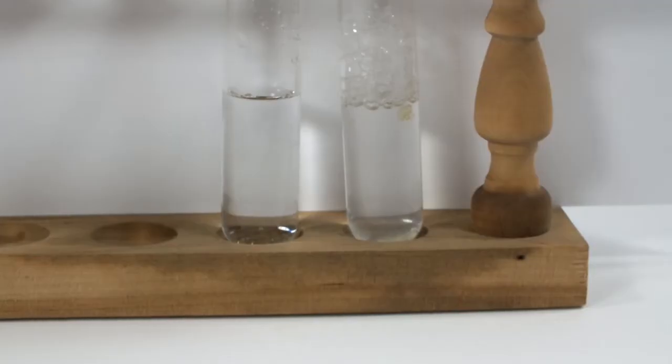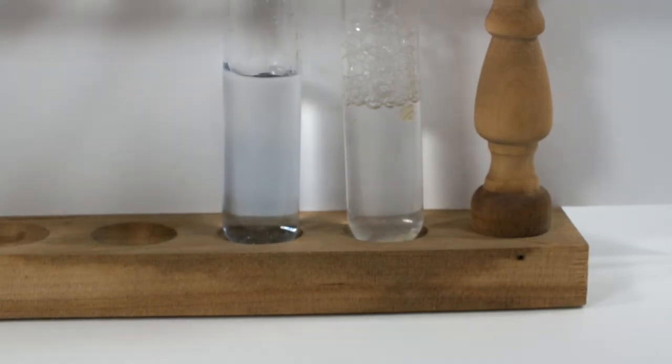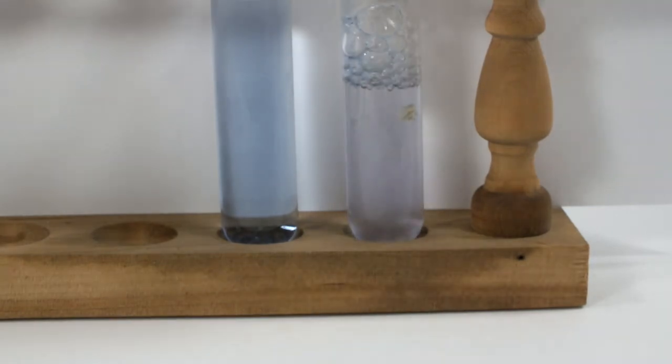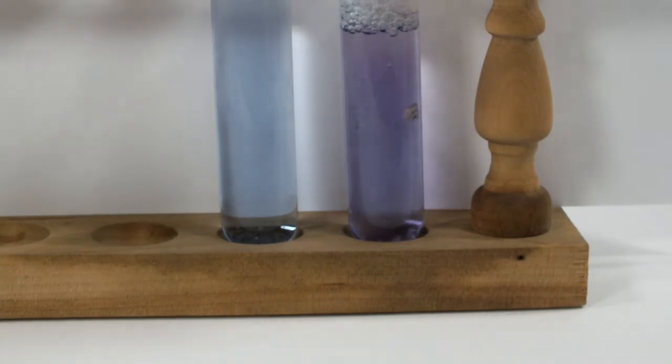Here we have two test tubes. The one on the left contains some distilled water as a control, and the reagent retains its blue color when it's added to the water. The test tube on the right contains a freshly prepared solution of chicken-egg albumin. Right away, you can see the color change to purple. I keep adding more Biuret reagent to intensify the color just for the sake of the video, but if you're doing a quantitative test, you would use a constant volume of the test reagent for every sample.